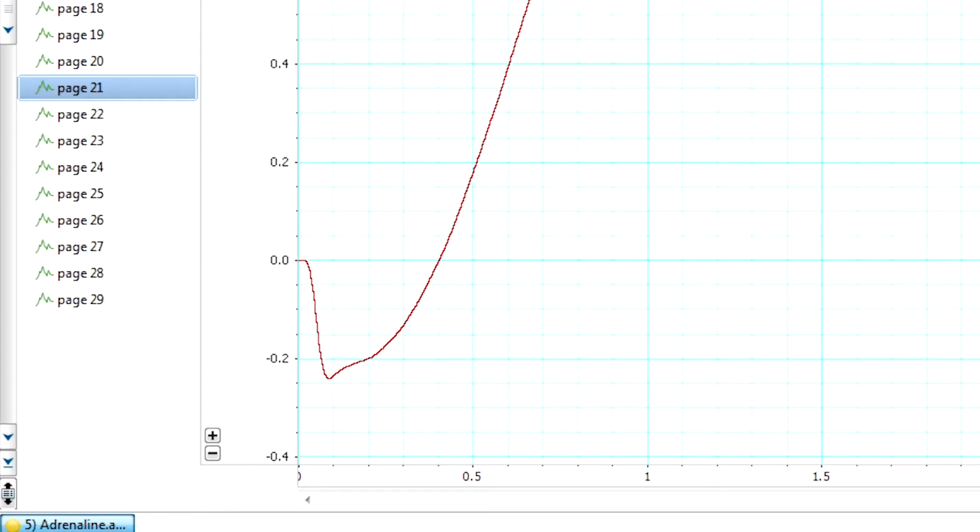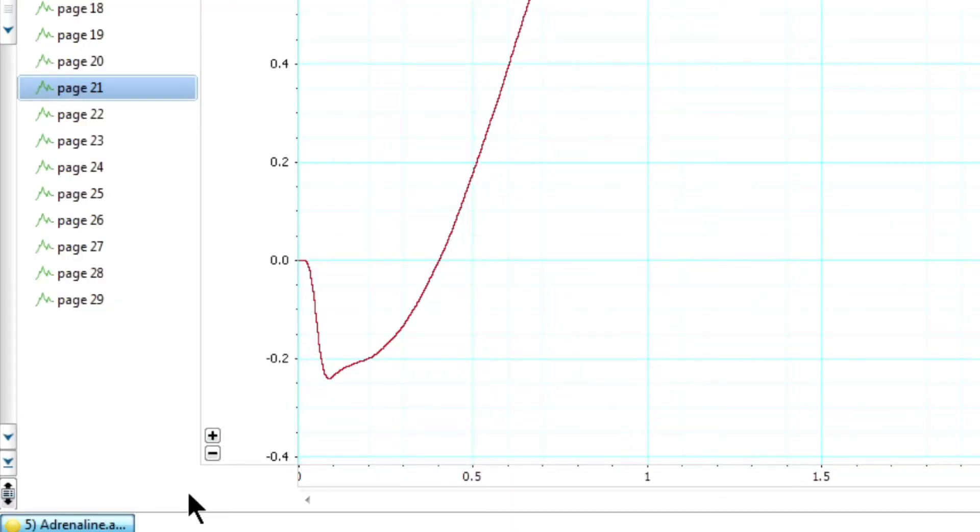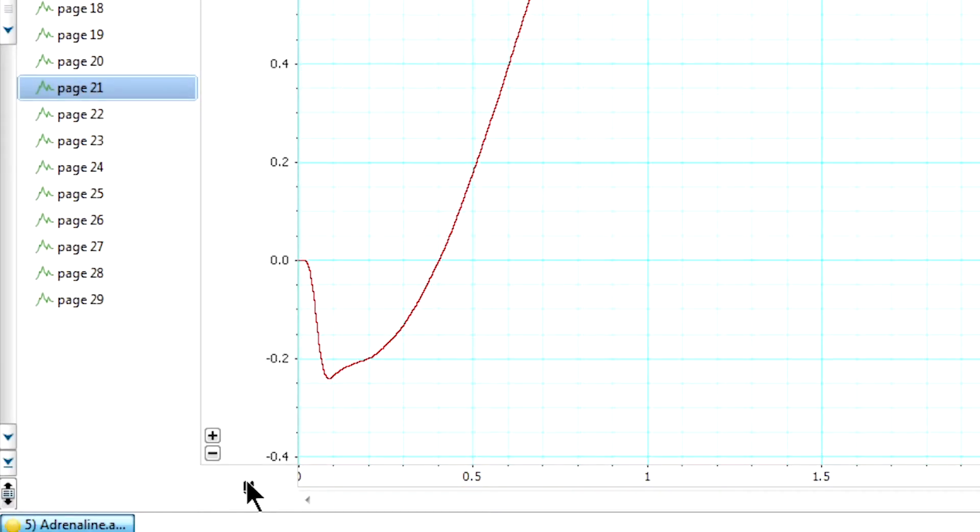If you ever can't find the marker, so if it's not down in its lower left hand corner box, or you can't see it on the screen anywhere, just double click on the box where it should be, and it will reappear down in that lower left hand corner.